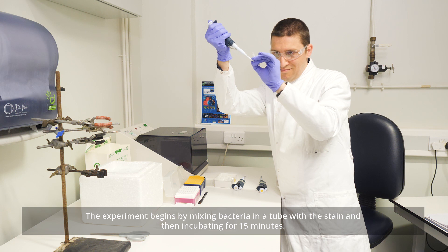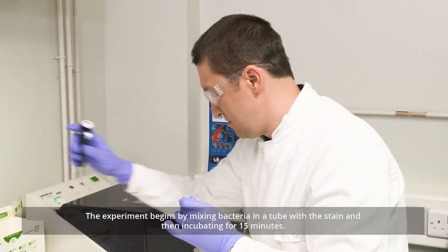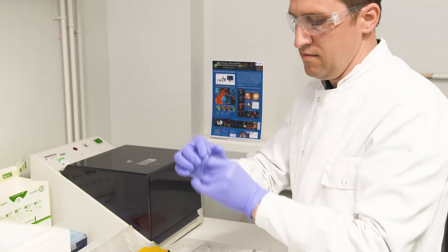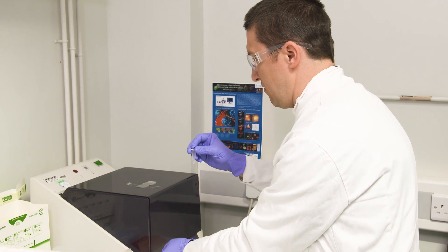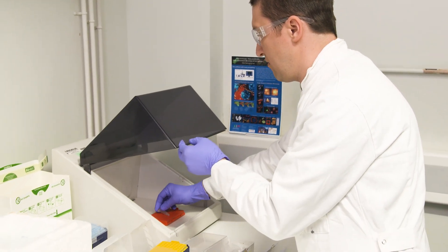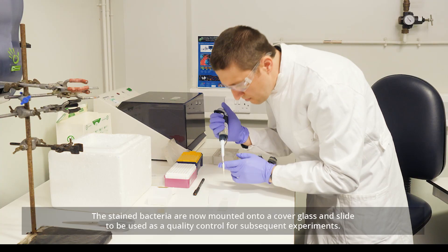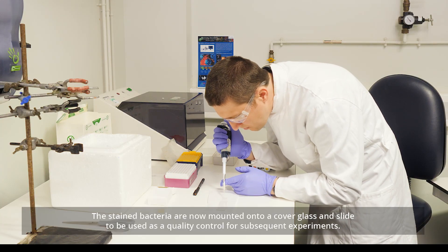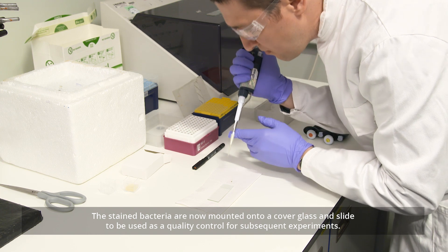The experiment begins by mixing bacteria in a tube with the stain and then incubating for 15 minutes. The stained bacteria are now mounted onto a cover glass and slide to be used as a quality control for subsequent experiments.